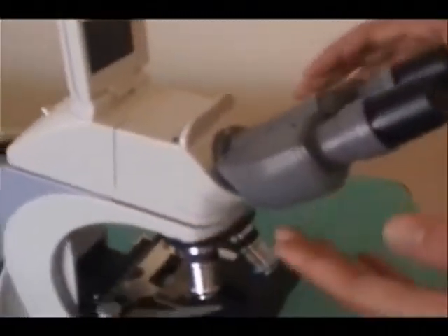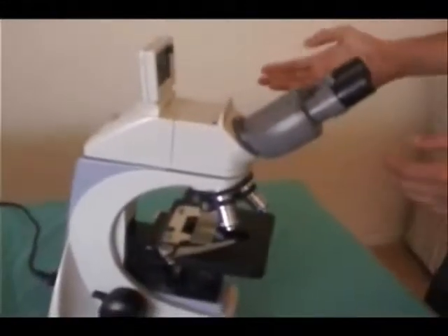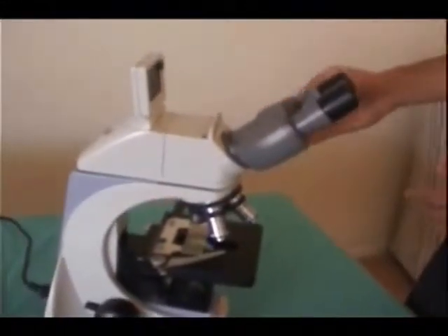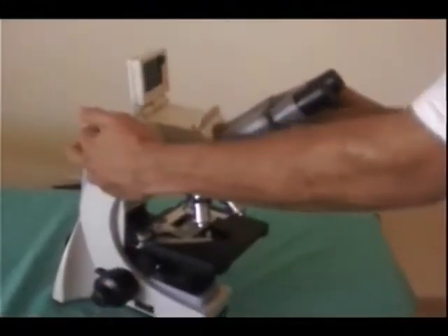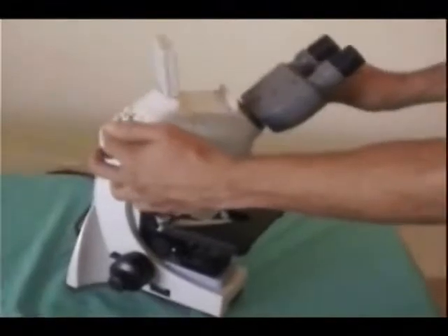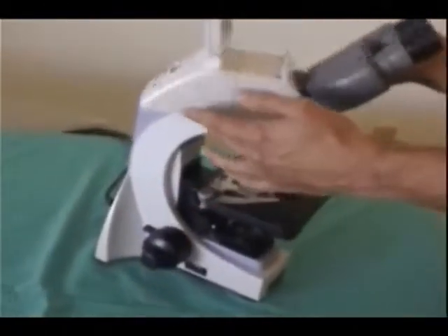A good feature about that is if there's anybody next to you either in the lab or in the classroom, you can easily allow them to view the specimen by using the swiveling feature. I love that feature about this microscope.